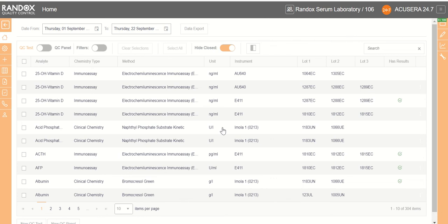Hello and welcome back to the Randox Acusera 24/7 training series. In this part we're going to be covering the Statistical Metrics report.